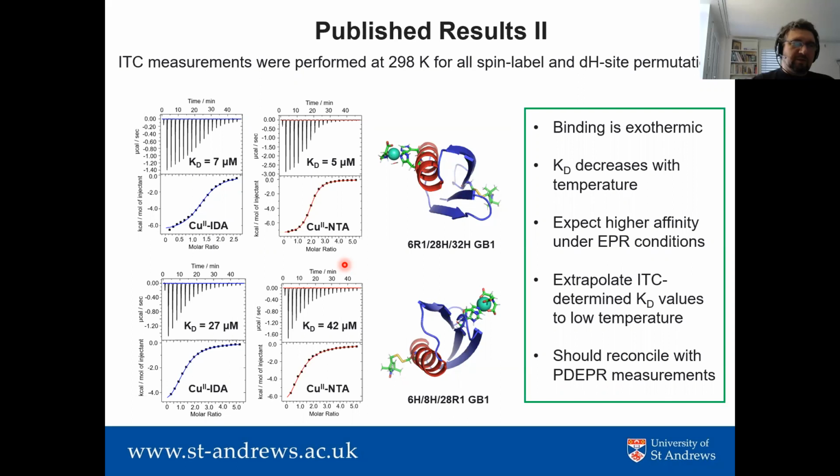No, it's clear that if you have a mixture, even though at room temperature the association is not completed, you cool down slow enough and then you get it almost 100% complete. But this means that at room temperature, many things can happen. For instance, if you need to make another purification step, then of course you're losing the copper label, right?